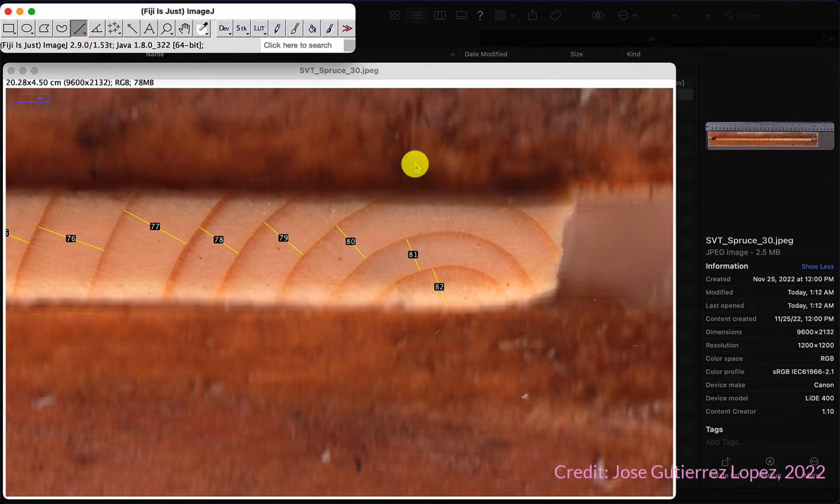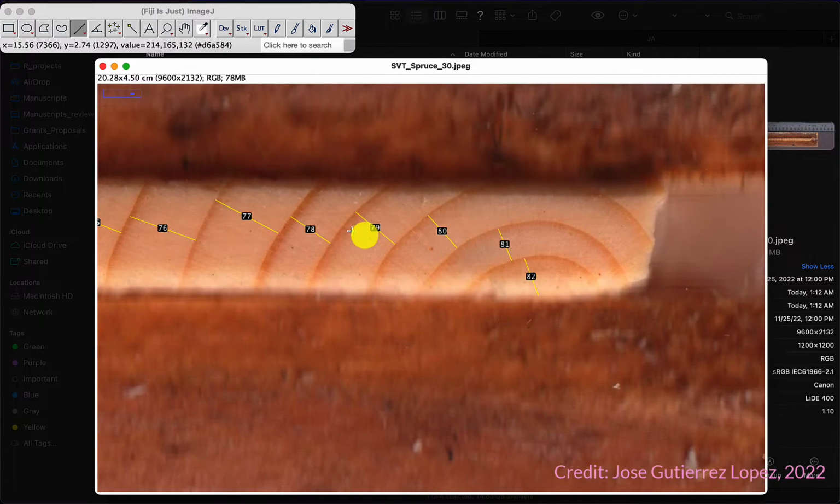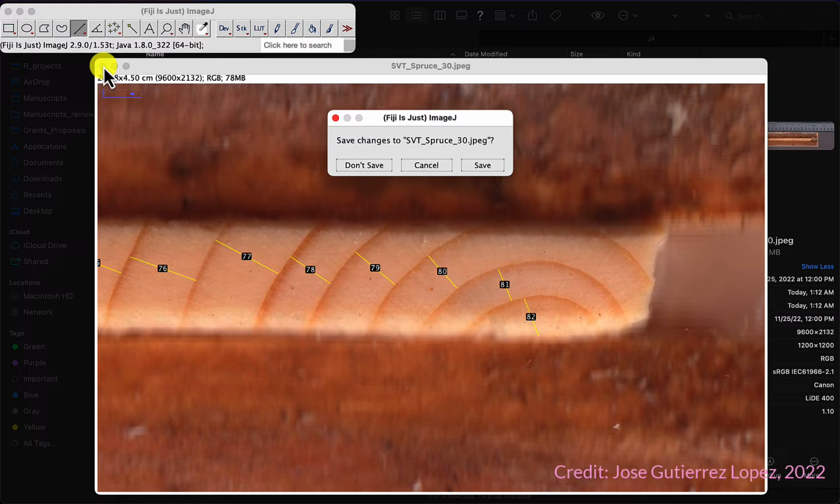Sure. I saved as overlay, but that's okay. I'm going now to close this. I do not think you need to save the image, because if you save the image, it's going to be saved as a TIFF file, I guess, and those are huge. It's like 180 megabytes a single image, so might not be necessary.